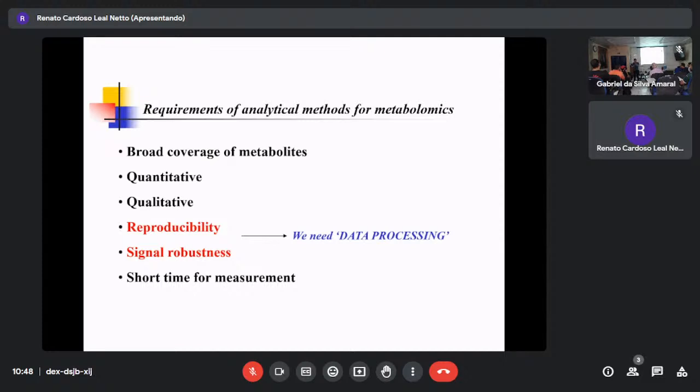So now in the NMR case, as long as it is soluble, a dynamic range of 100 times is no problem. Or even HPLC UV, very big dynamic range. When you do a calibration curve, 1 to 100 more is no problem. But in the LCMS case, even triple quad, maybe 10 times. Within 10 times, it's okay. Ion trap cases is much less. So that's why in ion range. Then how can you do this? You have to adjust the sample concentration. This is quantitative. Quantitative mass, yes, very quantitative, but within range. That's the dynamic range.